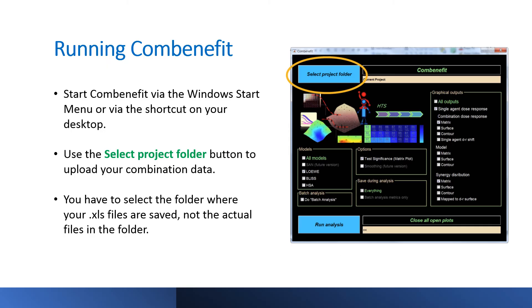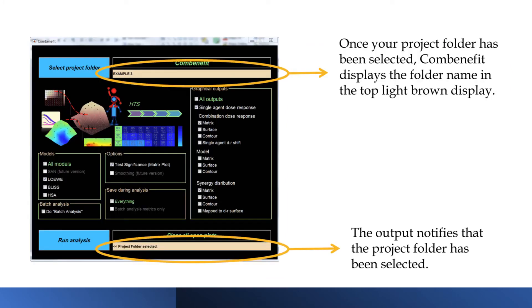To run ComBenefit, start it via the Windows Start menu or via the shortcut on your desktop. Note that it may take a few minutes for the interface to open, depending on your machine. Once the interface is displayed, use the Select Project Folder button to upload your combination data. Notice that you have to select the folder where your .xls files are saved, not the actual files in the folder. Once your project folder has been selected, ComBenefit displays the folder name in the top light brown display, and the output notifies that the project folder has been selected.